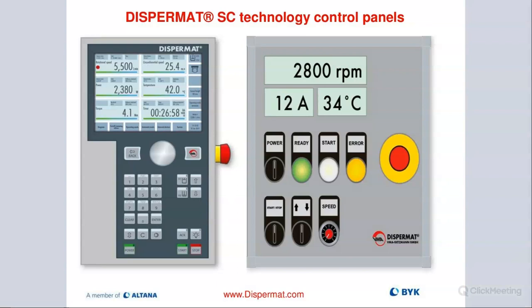Top right is actually the tip speed, that critical value we talked about before. Our temperature is in the middle there. And then on the bottom right, we have the timer function, allowing us to program the machine to shut off after a certain amount of time, or run with a different speed or different energy input once we complete our process. And then on the right side, a very simple control panel. It's an example of a manufacturing scale version, very simple.